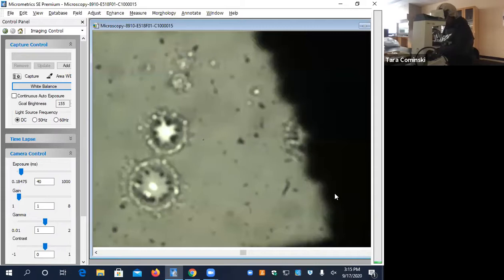You put that right here? Yeah, just part D there. See that? What's the total magnification when you're using your microscope under high power? It's 400x. I think your mic was muted.